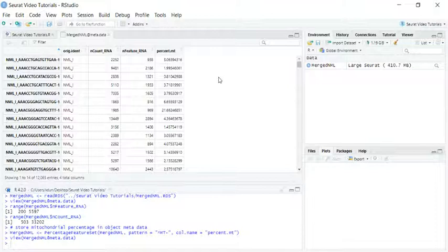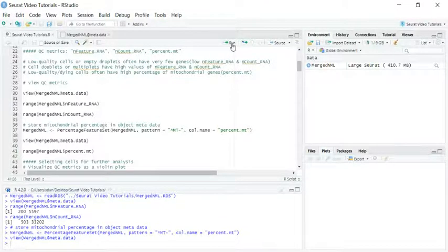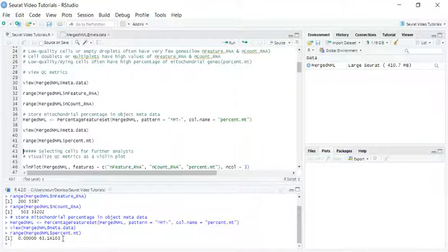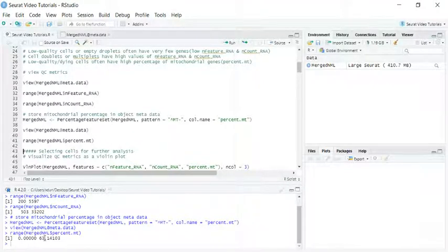Now you can see we have the percentage of mitochondria genes for each cell. We can use the range function again to look at the lowest and highest percentage of mitochondria genes. The lowest is 0 and the highest is more than 63%. So certainly, we need to get rid of cells with a very high percentage of mitochondria genes for our analysis.